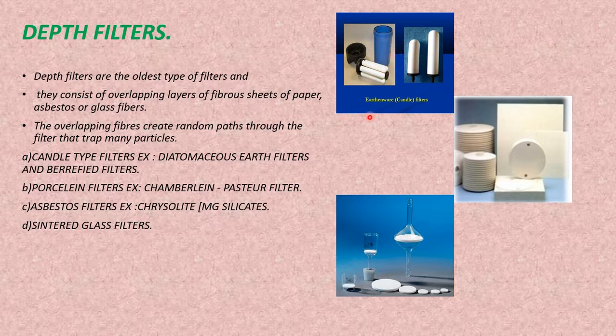And then coming to the porcelain filters, or Chamberland or Pasteur filters. These consist of hollow unglazed cylinders. It may look like this, but it is somewhat different.